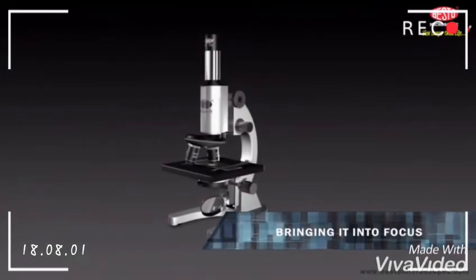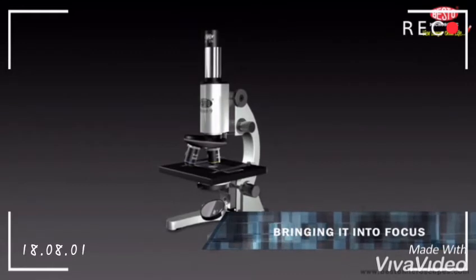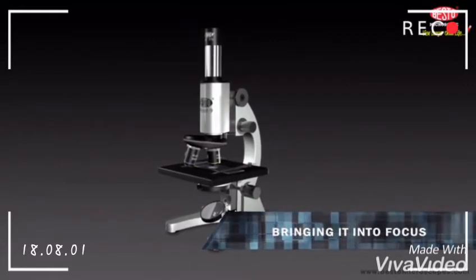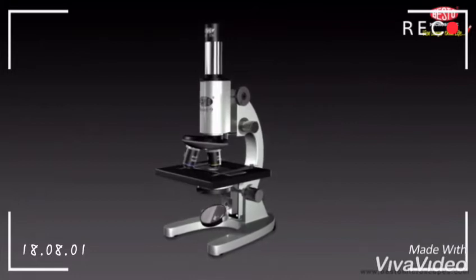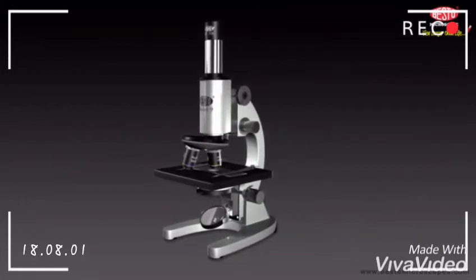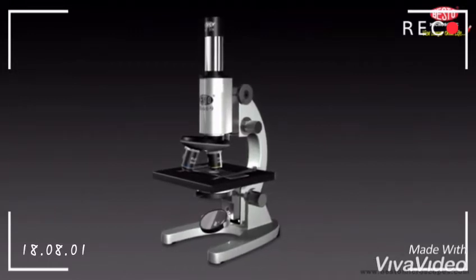A microscope is an instrument for producing a greatly magnified image of an object such as a specimen, which may be so small as to be invisible to the naked eye. In this video, we will discuss the parts of the microscope and their functions.